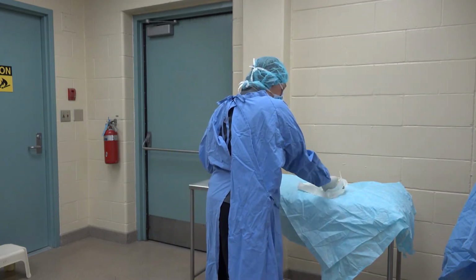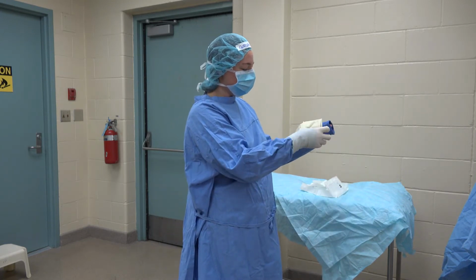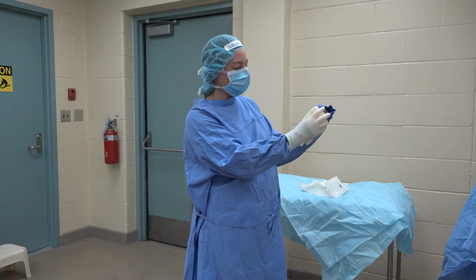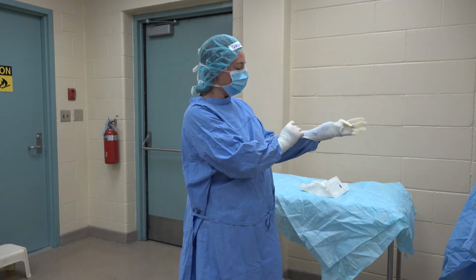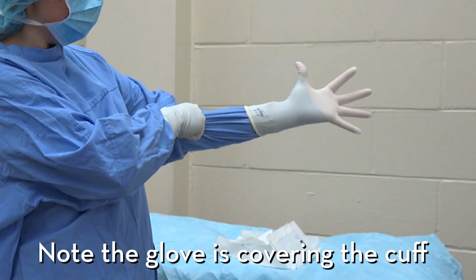Then I grab the other glove, same thing. So thumb to thumb, grab the inside portion, the thumb portion with my fingers and thumb, and then lift the glove over the top, pull the sleeve down, pull on the sleeve, and fingers come through nice.